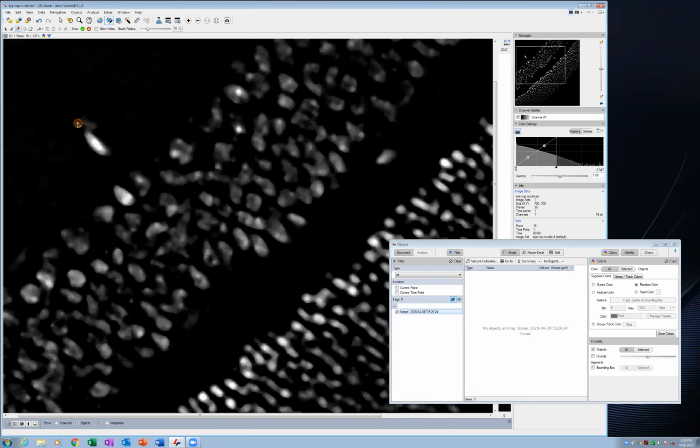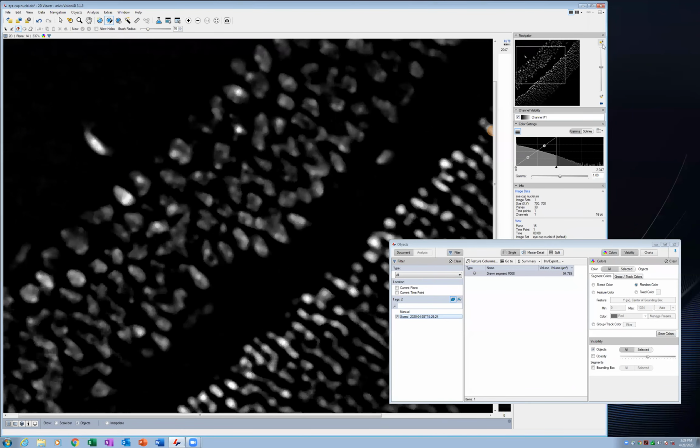And that looks like about where it ends, so we'll just get rid of it there. All right, so we hit the checkbox, that one's done. And then we're going to do that other one.